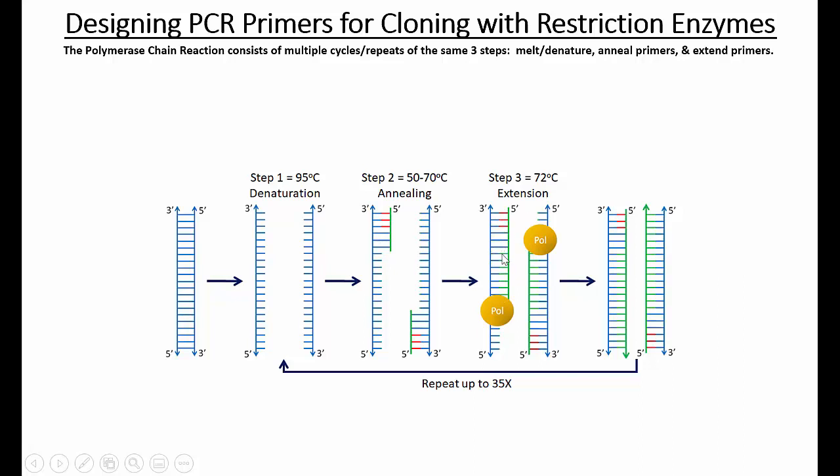It'll start copying the template sequence onto the primer. So we get this primer extension here in the 3' direction, and this is going to happen for both primers, such that at the end of this cycle, my primers will have grown substantially to copy whatever was in the target sequence here.